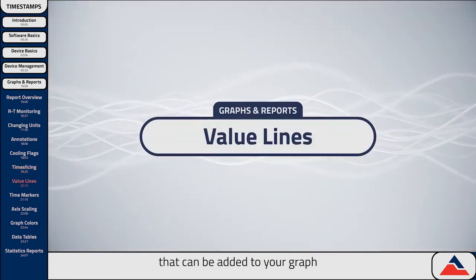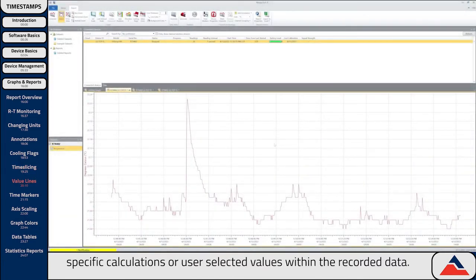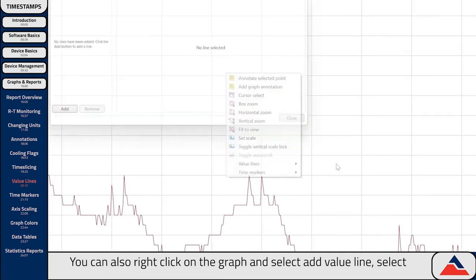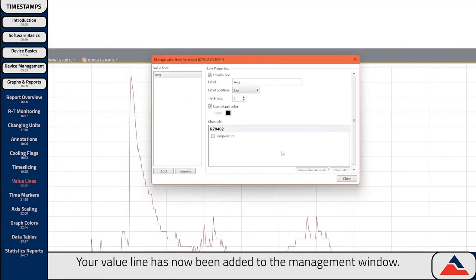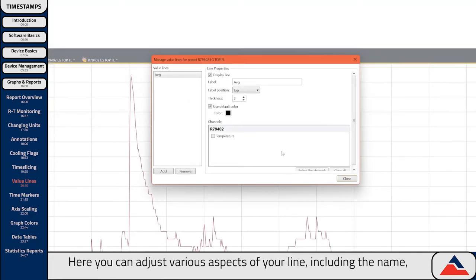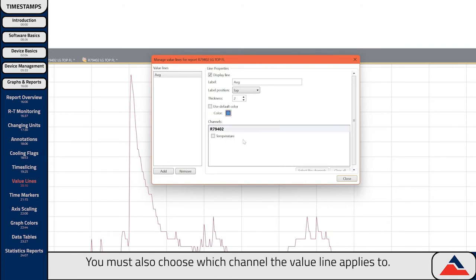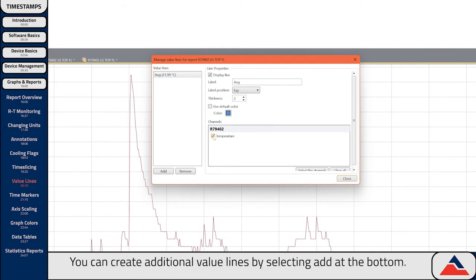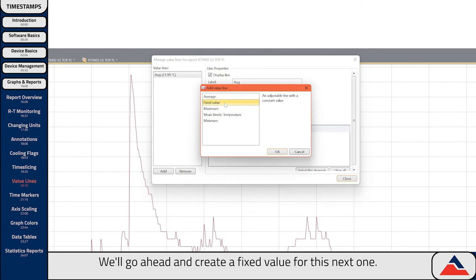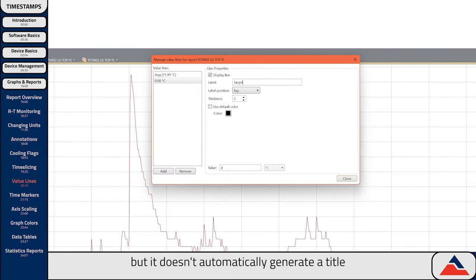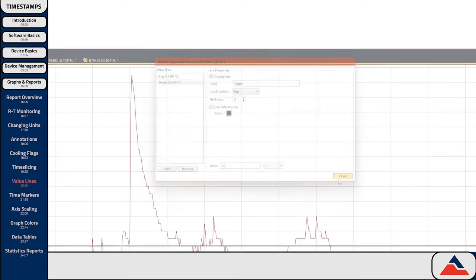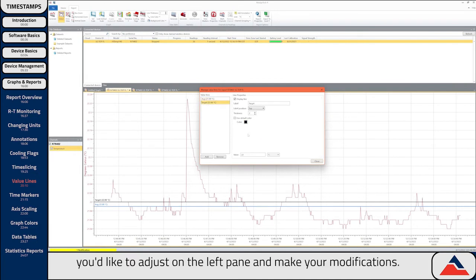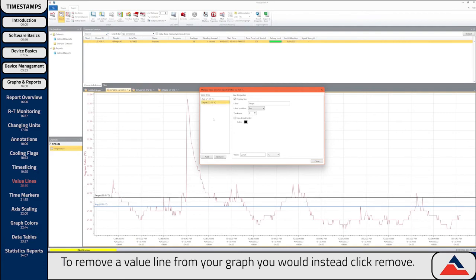Value lines are horizontal lines that can be added to your graph to reference specific calculations or user-selected values within the recorded data. To add a value line, select the Value Lines icon in the Reports menu bar, or right-click on the graph and select Add Value Line. Select a line type and then click OK. Your value line has now been added to the Management window, where you can adjust various aspects including the name, position, line thickness, and color. You must also choose which channel the value line applies to — for example, selecting the temperature channel will mark the average temperature throughout the study. You can create additional value lines by selecting Add at the bottom. If you'd like to adjust your existing value lines, right-click on the graph and select Manage Value Lines. To remove a value line, click Remove.